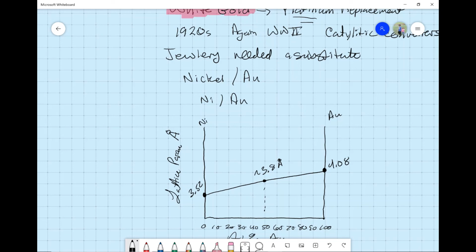One other thing, if you do XRD, okay, and you're getting two distinct peaks, and the d-spacing of 1, 0, 0 matches either nickel or gold, and you don't see anything else, then that means you're not really alloying at all. That it's a non-alloyed mixture.